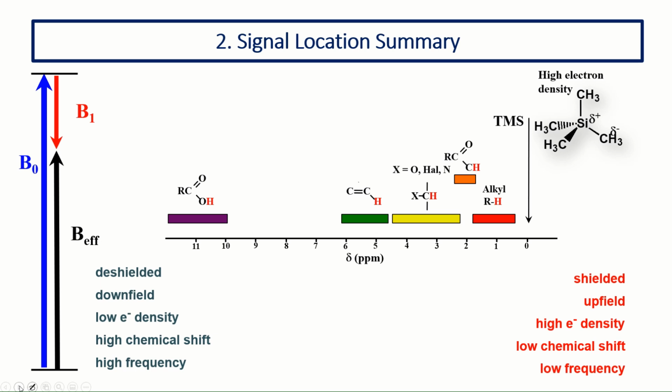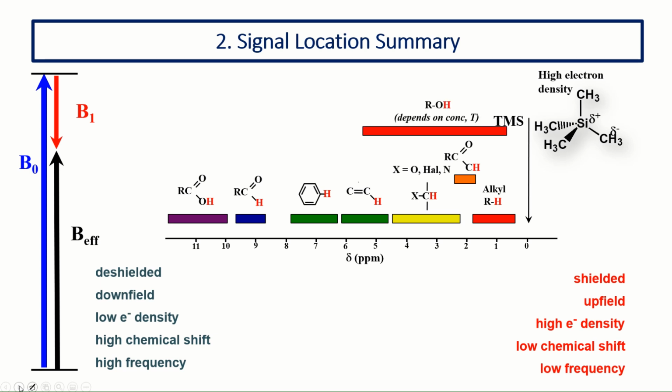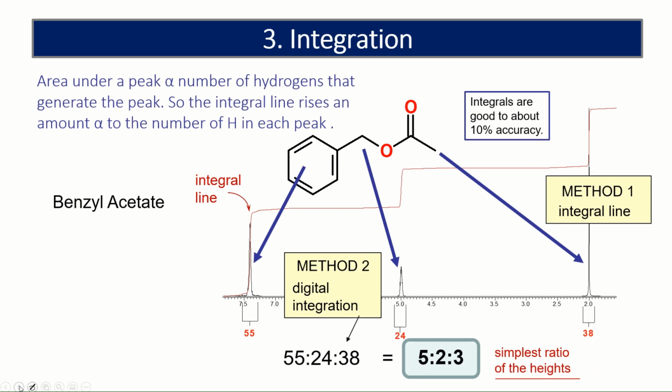And of course, you can see, for example, our alkenes will appear at 5, 6 ppm, and the aromatics around 7 ppm, and our aldehydes at 8 or 9 ppm. You can see alcohols, quite strange. With the hydrogen bonding, we can't exactly predict where they're going to turn up, and it depends on concentration. And of course, our alkynes are, not deshielded, but shielded.